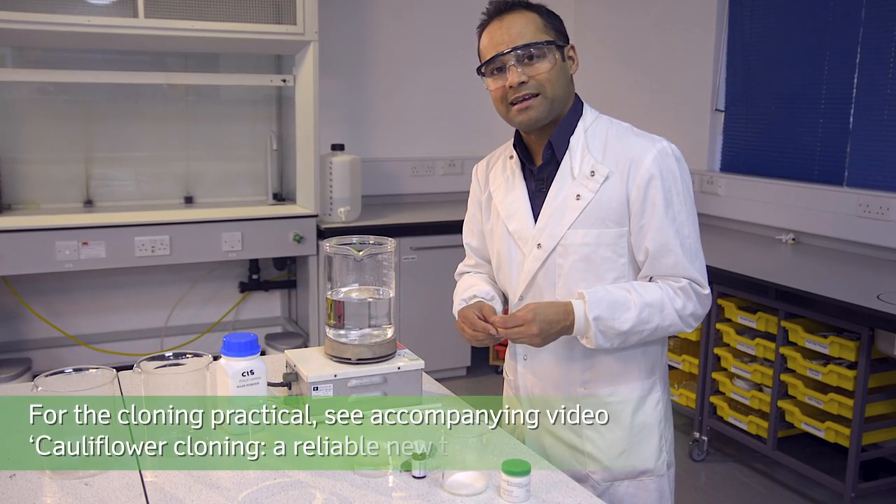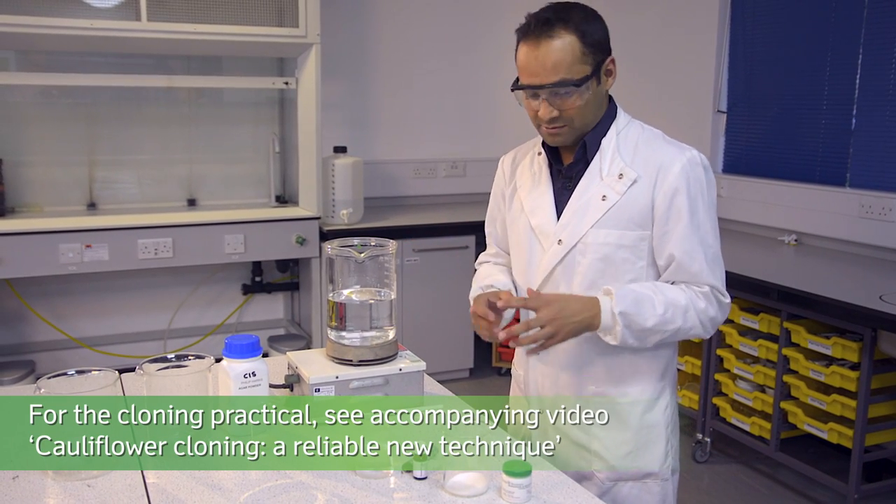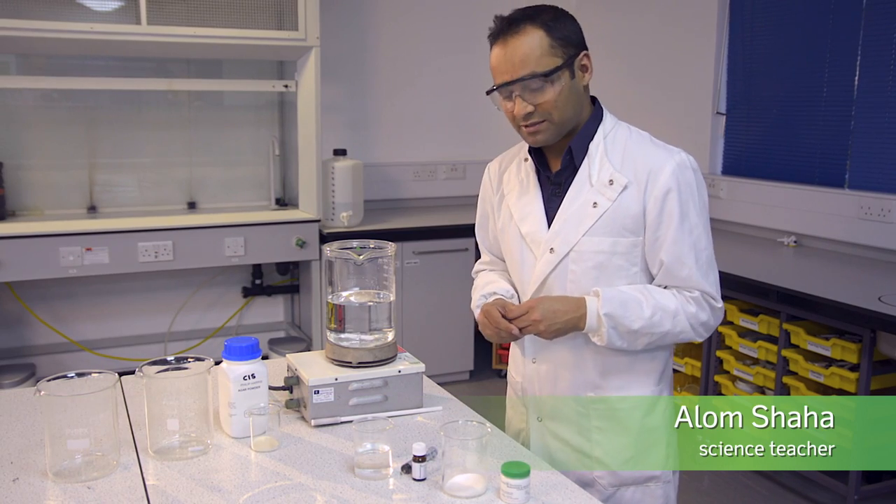The growth medium is fairly straightforward to make, but you will have to prepare it in advance. It's got just six ingredients, which I've weighed out in advance, but you can find the precise quantities on the SAPS website.